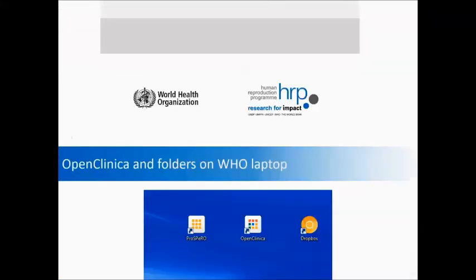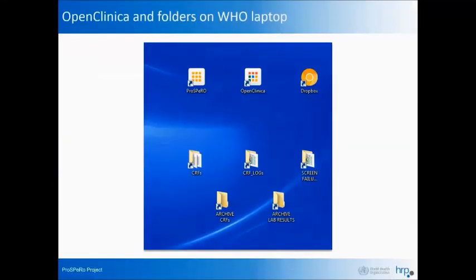In order to provide you with concrete examples of the data entry process and to show you how the OpenClinica system operates, we will make reference to the protocols and to the OpenClinica profile that the Verona team is using in Italy to implement the project and manage the POCT data.